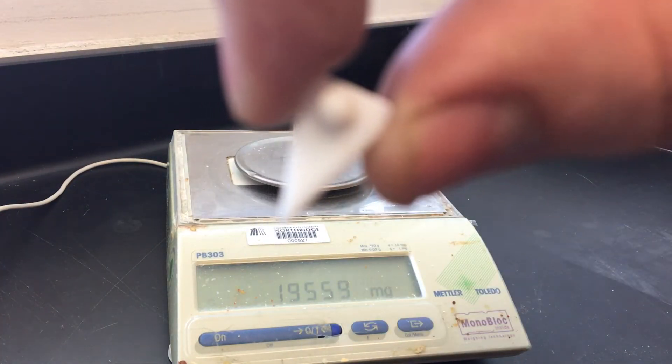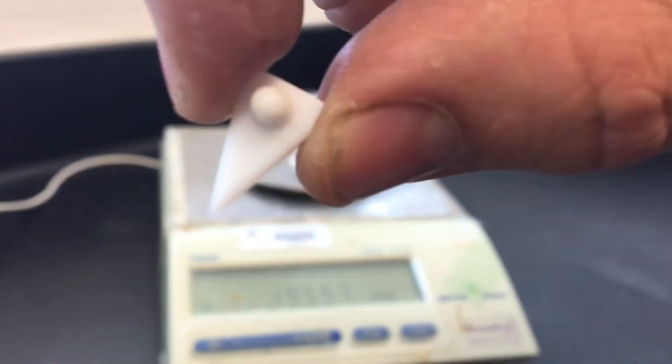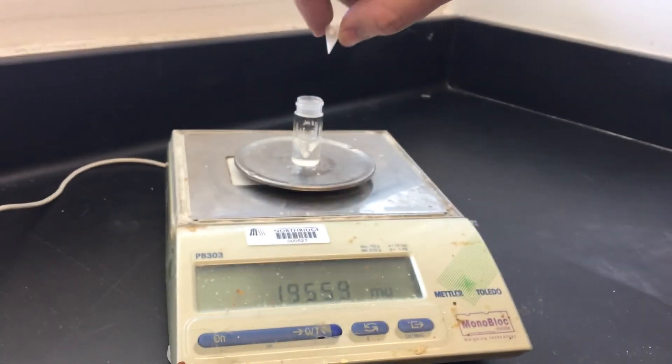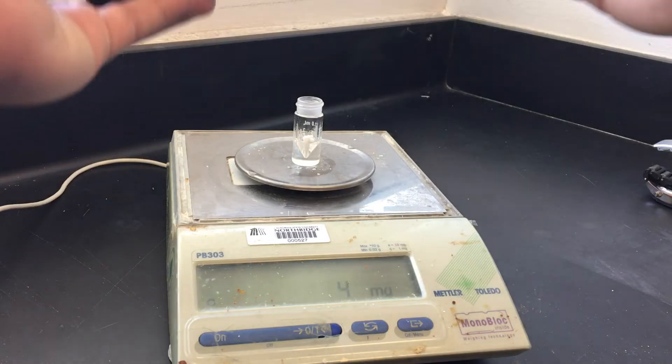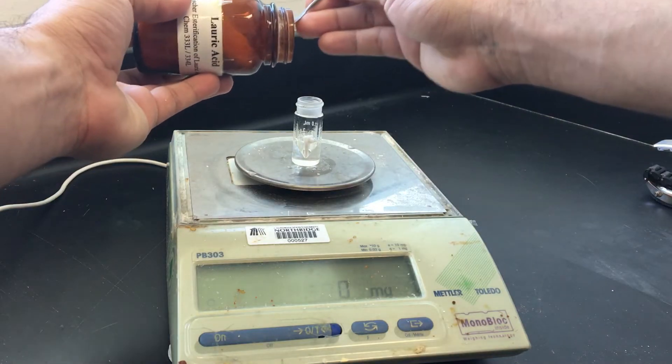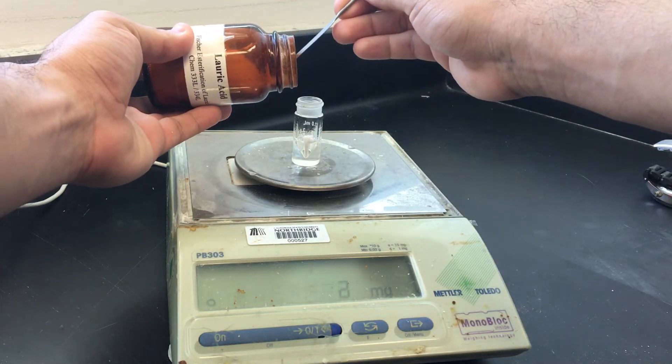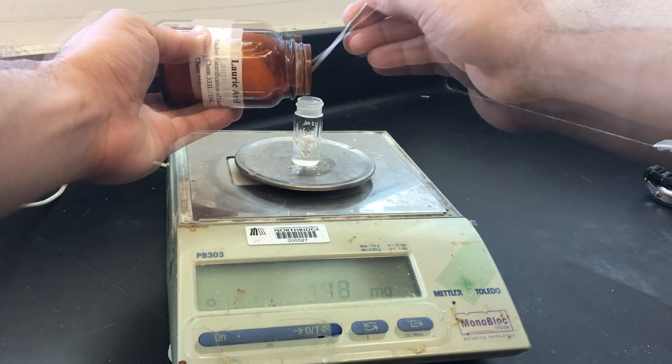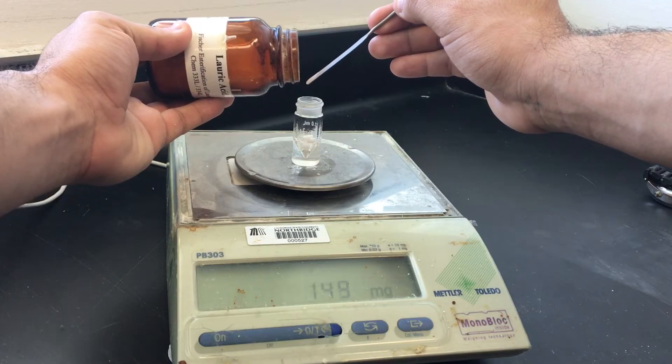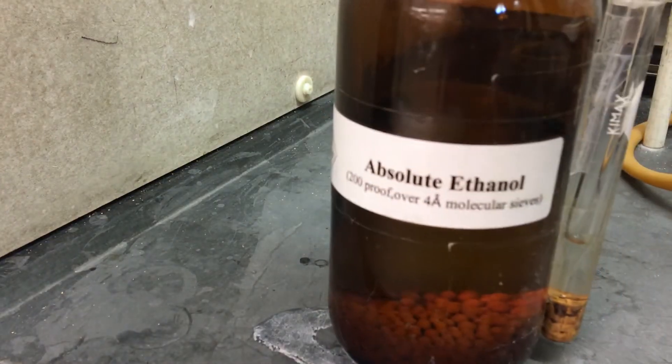Before I measure out my lauric acid, I'm going to put in my spin vane. That's a little triangle spinner right here. You always want to have it point down with the little knobs up top. Now, in case you haven't seen it before, the easiest way to measure out an exact small amount of powder is to hold the container right above the flask and scrape it out using a spatula. Just like this. Once you've reached your target amount, make sure to write it down before you forget.